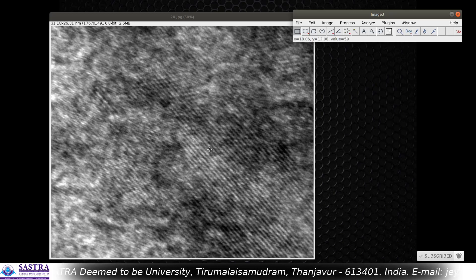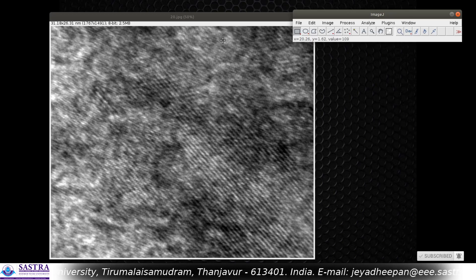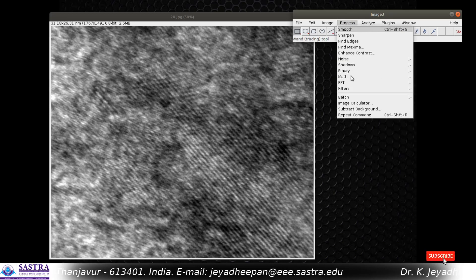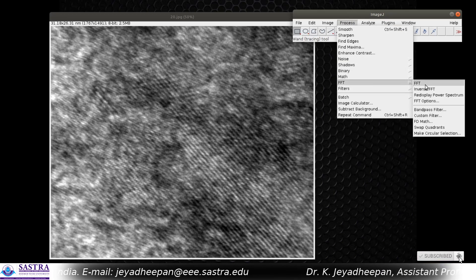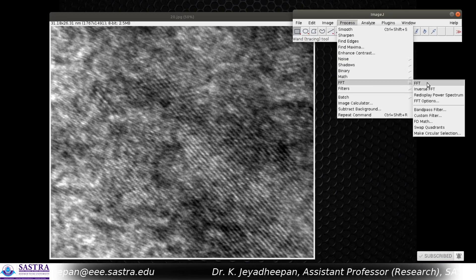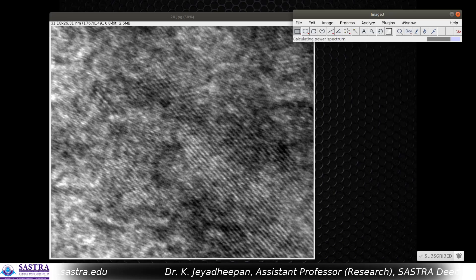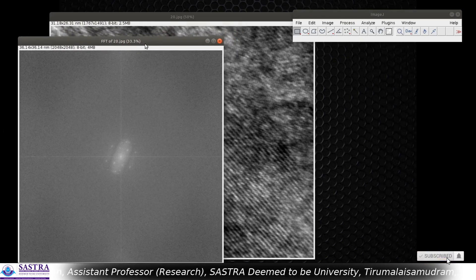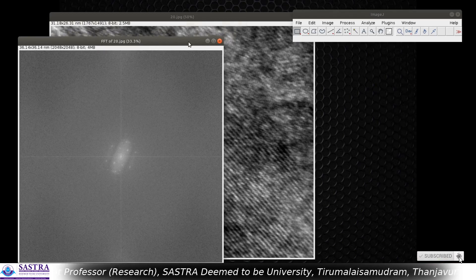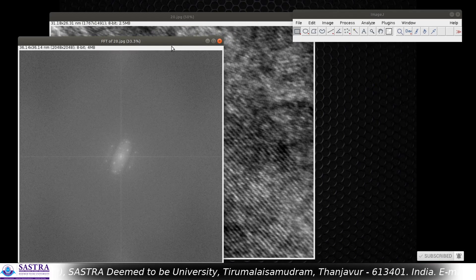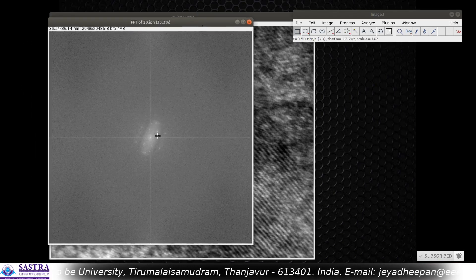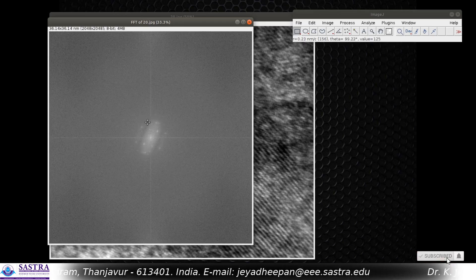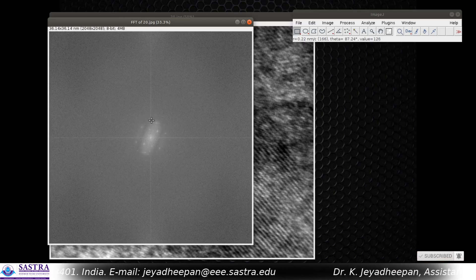The first thing we have to do is go to Process, then FFT, and press FFT. Now you will get the Fast Fourier Transform image of this particular lattice fringes. Here you can see so many Fast Fourier Transformed patterns with many spots.